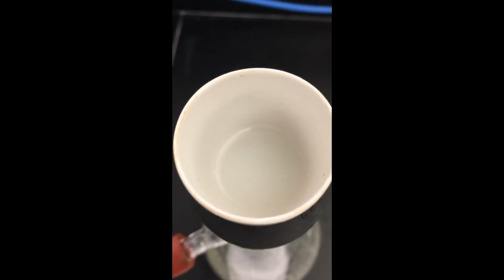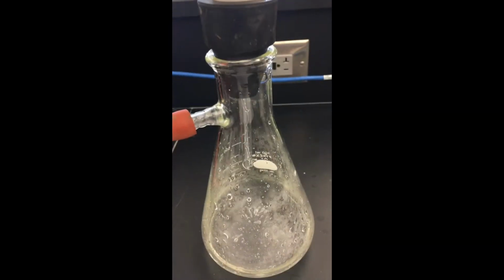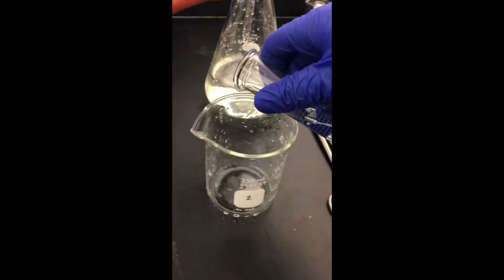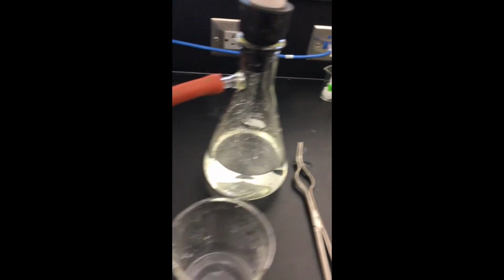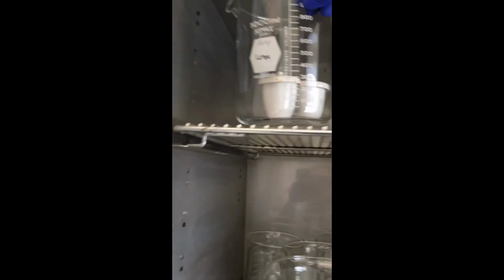Next, you're going to set up your crucible filtration apparatus and filter each one of your solutions into the crucible. Be sure to rinse your sample beaker with about 10 milliliter portions of ice-cold DI water to get the rest of the solid out of the beaker. Filter through the apparatus. Once all your samples are filtered into the crucible, place the crucibles back into the oven for about a day.